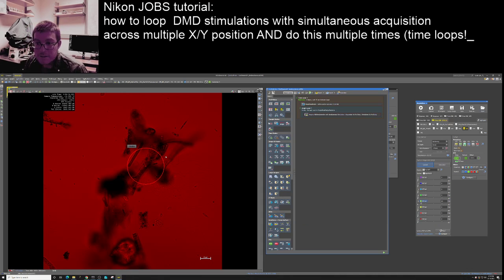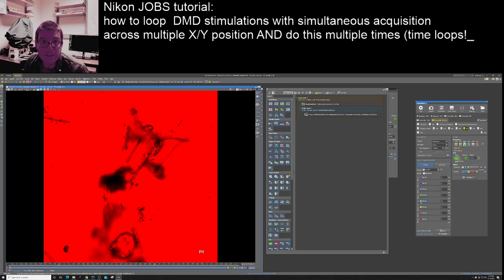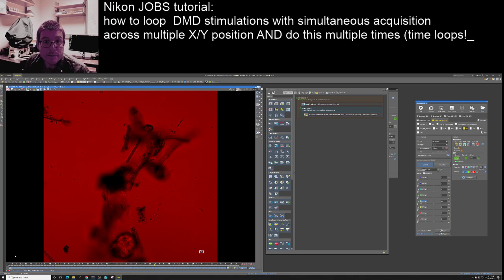So if we open one of these, what we'll see is the experiment we did, basically. So we can run, and then boom, see it there, and off it goes. And I believe, for some reason it's not showing us the location of the stim.